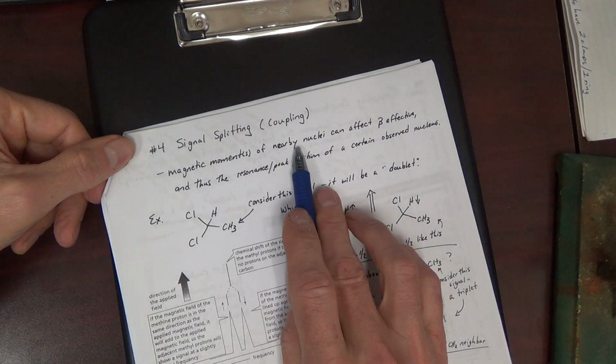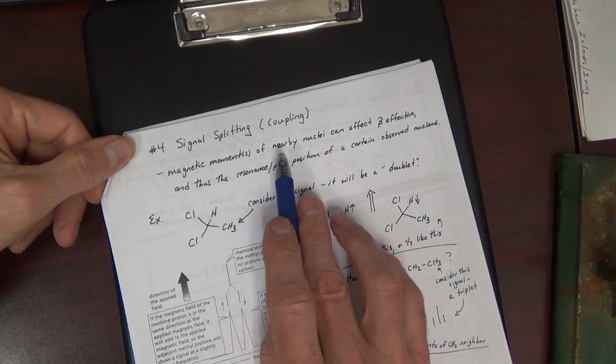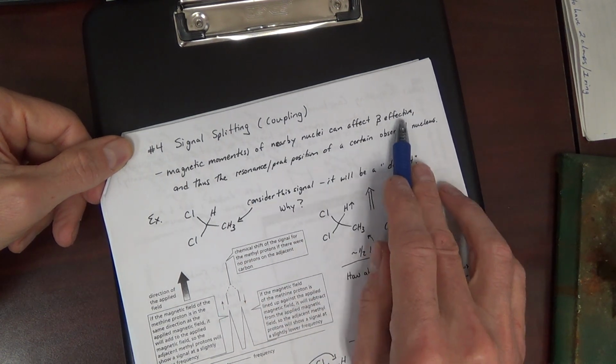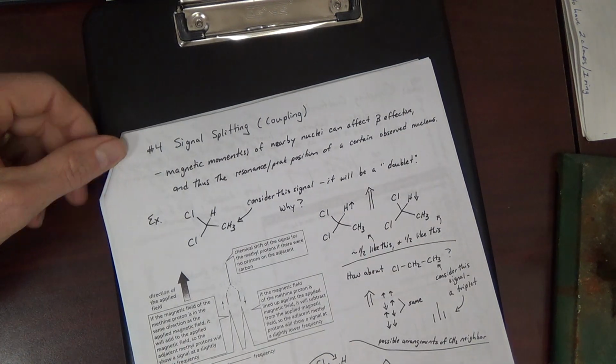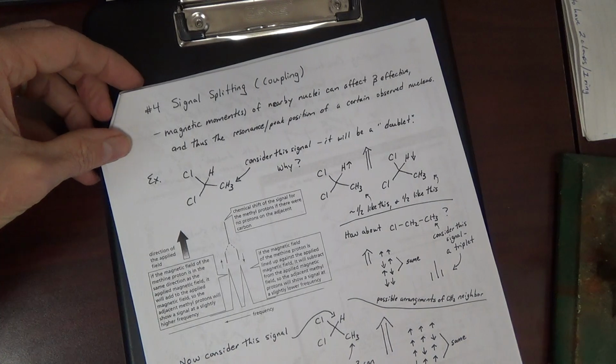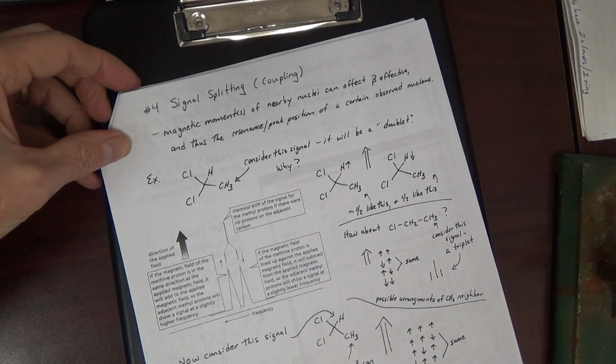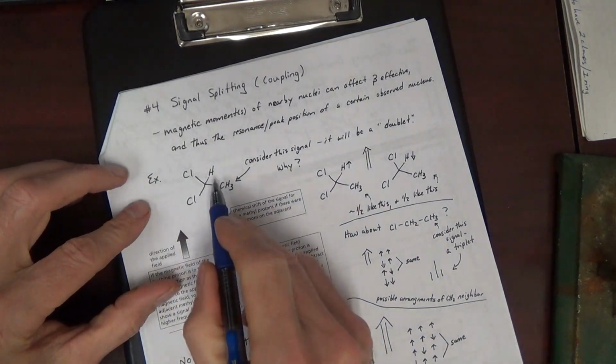But something else can affect the B effective. Nearby nuclei also have magnetic moments. And the magnetic moments of the nearby nuclei can affect the B effective as well. So, let's look at an example. This compound here.